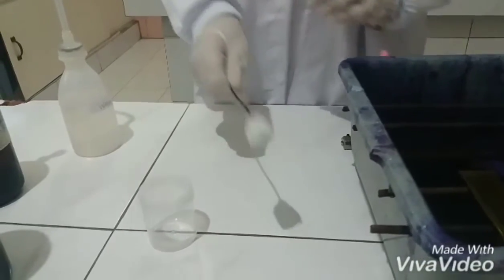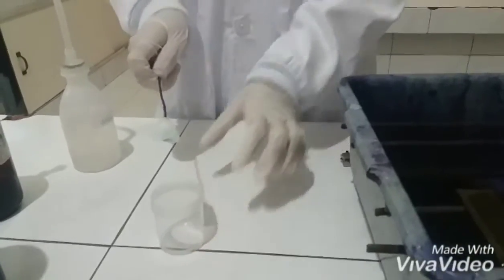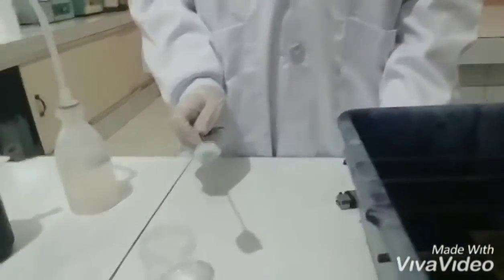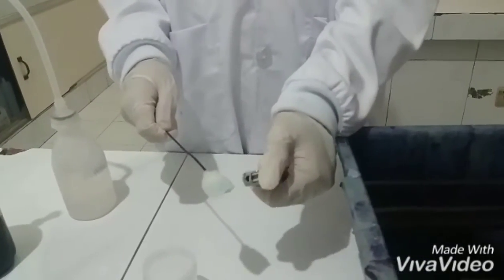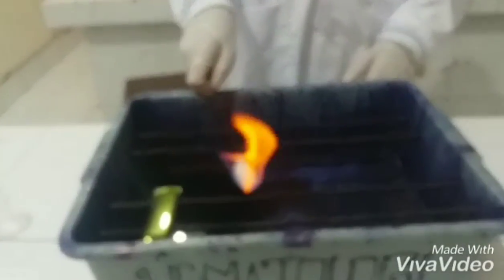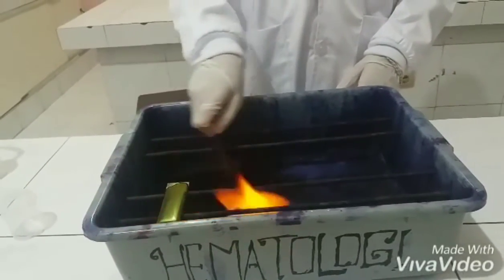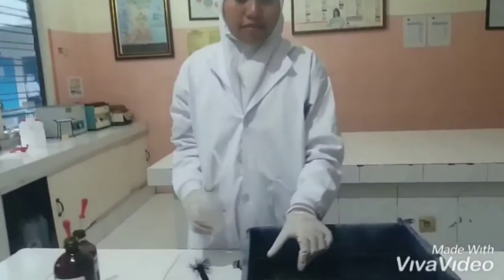And then dip the cotton in alcohol. We burn it by lighting the cotton with a match. We heat like this for 5 minutes. Don't boil, just enough for white smoke to come out. And then we rinse with water.